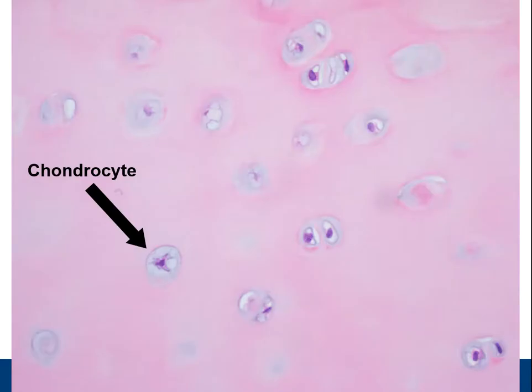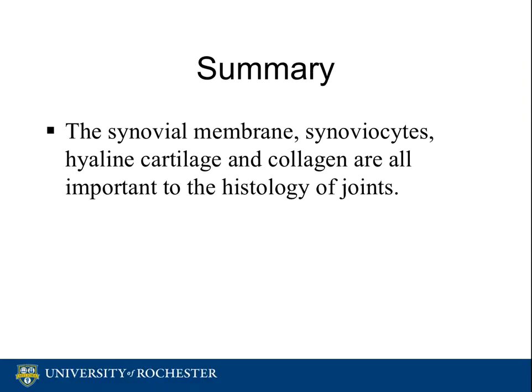This is a high power view showing chondrocytes in the articular cartilage. In summary, the synovial membrane, synoviocytes, and hyaline cartilage are all important to the histology of joints. That concludes our review on the normal histology of joints.